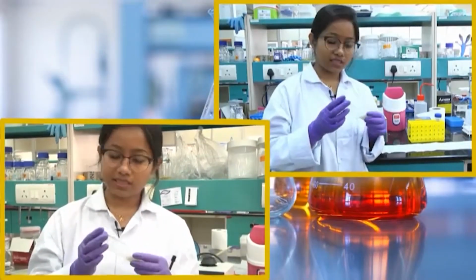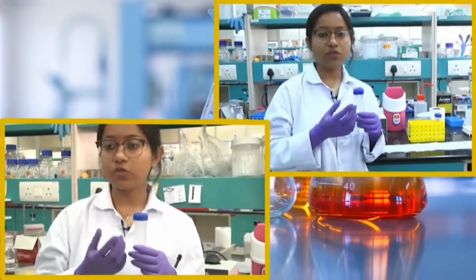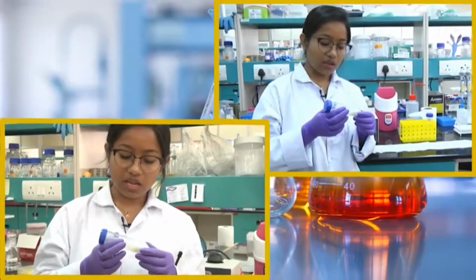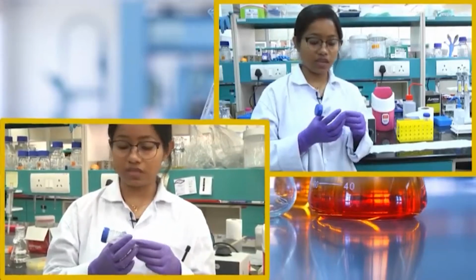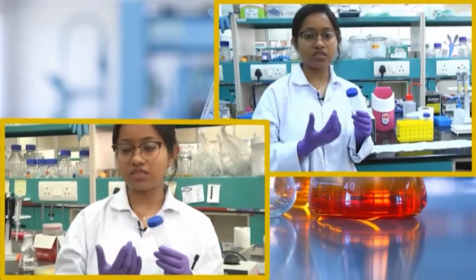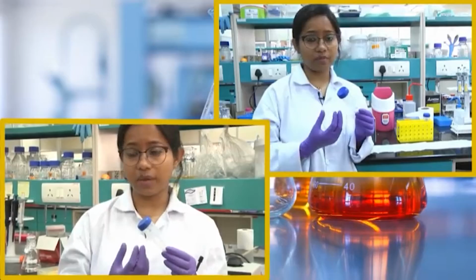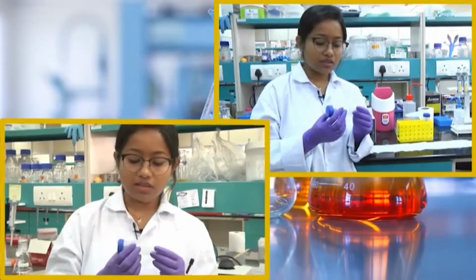Now, after the lysis has been done, you need to degrade or basically remove the other cellular components. In this procedure you can go for different machines, depending on what kind of cells you are using. Here we will use a sonicator machine. That generates ultrasonic sound vibrations that will degrade the cellular membranes and other big molecules like DNA and RNA.